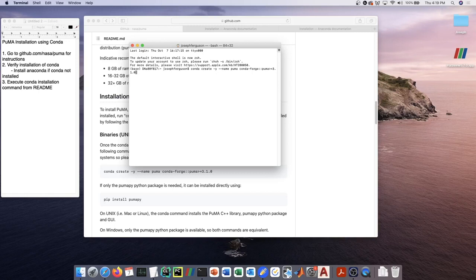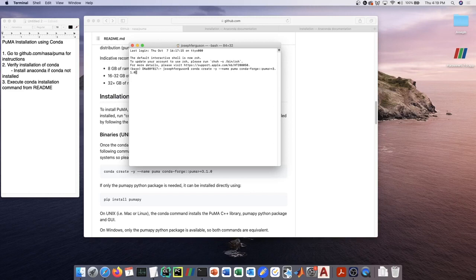Now when you hit enter, it may take some time and it may just hang here for a while. Just be patient, don't kill the installation mid-install. Just hit enter and give it 10-15 minutes—probably won't take anywhere near that long—and the installation should go through. So I'm going to go ahead and click enter and skip ahead to once the installation is done.